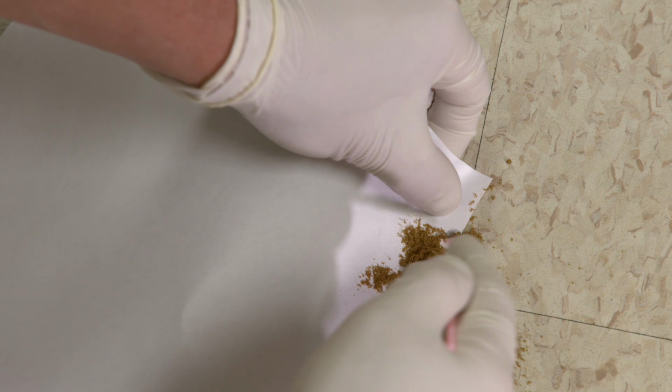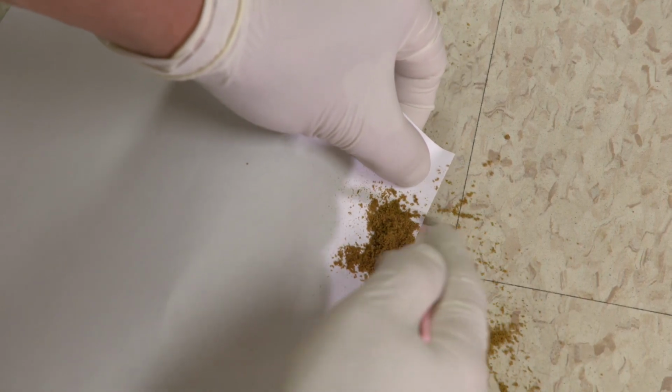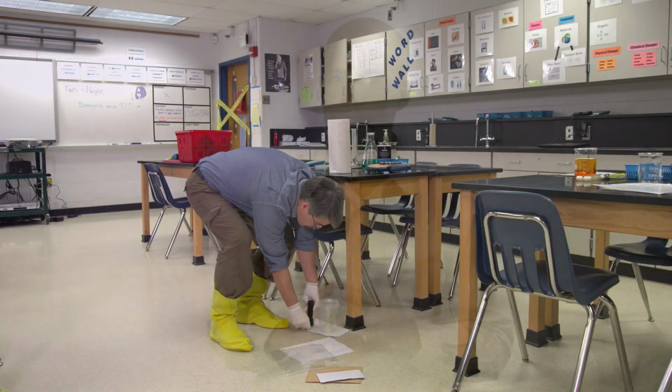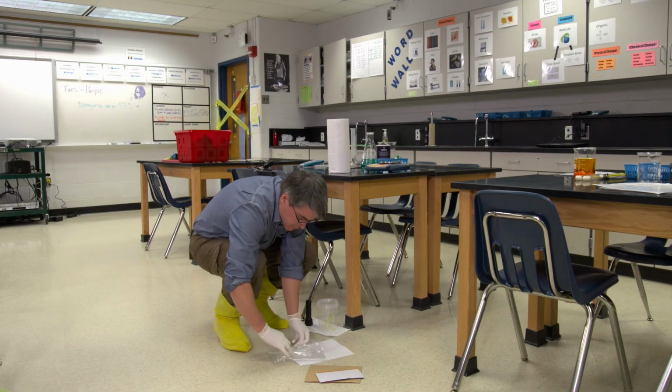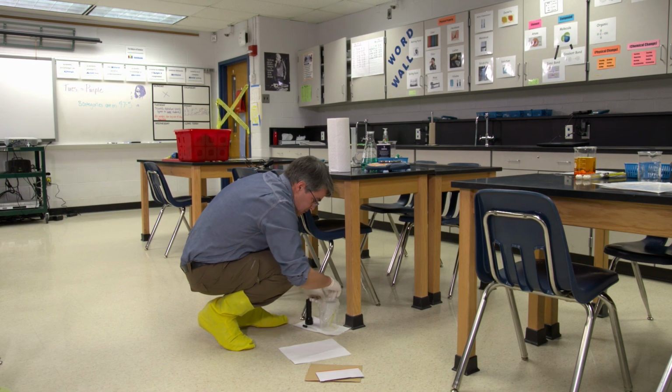Pour the powder over the spill area. Using a small brush, gently brush the powder onto a piece of paper and put the material into a zipper-top bag. Note that sulfur makes drops of mercury easier to see because it causes them to change color. It also causes the mercury drops to join together, which makes them easier to clean up. Be very careful when using powdered sulfur, as breathing it may be harmful to your health. Put the duct tape, paper, brush, and anything else that touched mercury in zipper-top bags and zip them shut.